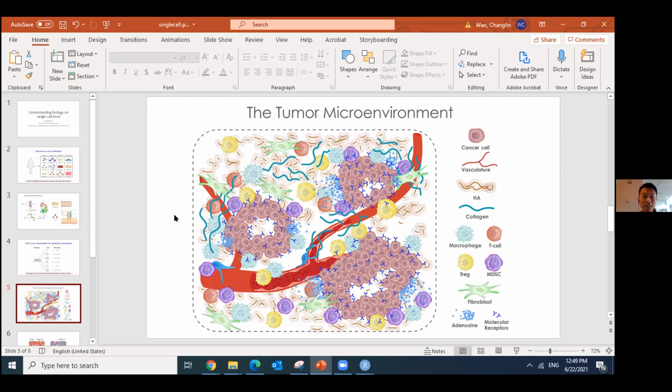Yes. Is that possible? Yes, it's actually what's going on right now, but I don't think that would go in too far for introductory. But as Alisa suggested, that's really what's going on, that we are seeing precisely what's different, especially how different patients have different tumor cells. So we could develop different personalized strategies for different patients, even though it's the same tumor, but you will have different results.